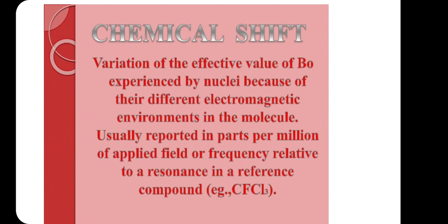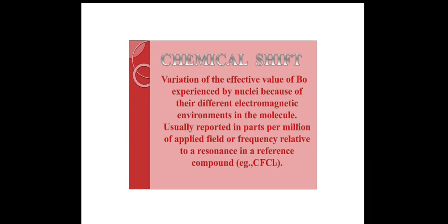It is usually reported in parts per million of applied field or frequency relative to a resonance in a reference compound, CFCl3.